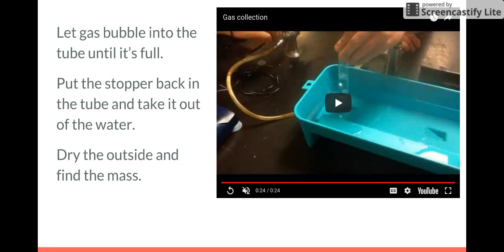From there, you can put the stopper back in the tube. The important thing is that you put the stopper in while the tube opening is underwater. If you just take the tube out of the water without putting the stopper in, all the gas will escape and you're going to have to do it again.